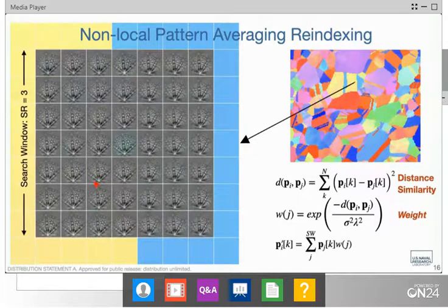Here are the patterns, and you notice that there's a lot of similarity between these patterns. It has a pseudo-symmetry type situation, right? Some of these poles are very much located in the same locations between the twin. There's some bands here that are very similar. So can this effectively differentiate between those two sets of patterns?